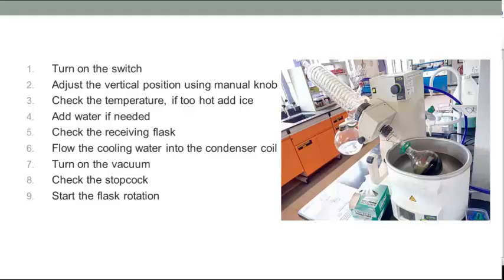But you have a choice if the stopcock that controls the vacuum has been placed on your rotary evaporator. If you carefully touch the flask with your finger, it should be cool due to the evaporation. Once the solution is cool, close the stopcock to generate a vacuum in the apparatus. Now, carefully lower the evaporation flask until the lower surface of the glass is submerged into the water bath. If the solution boils vigorously, release the vacuum with the stopcock. Once the flask is stable, then you can remove your hand from the tap and leave the solution to evaporate.